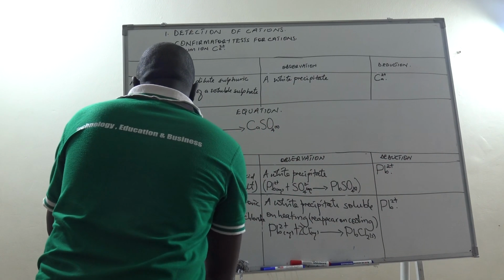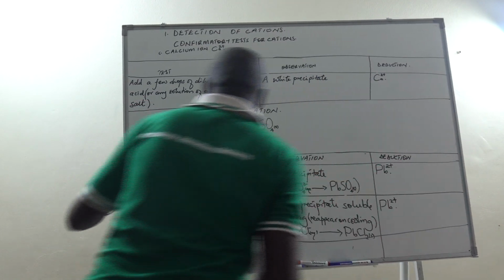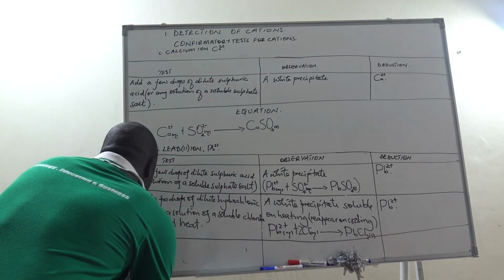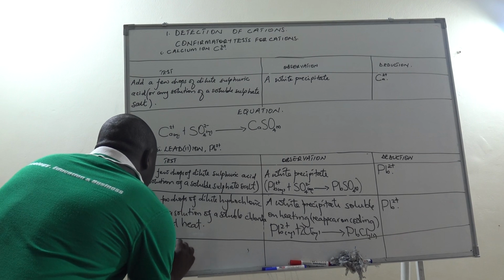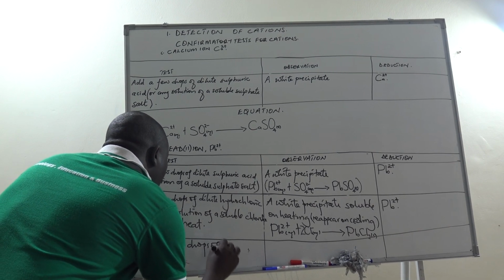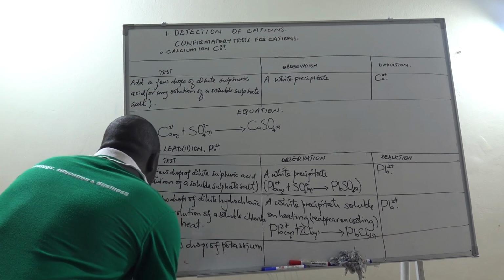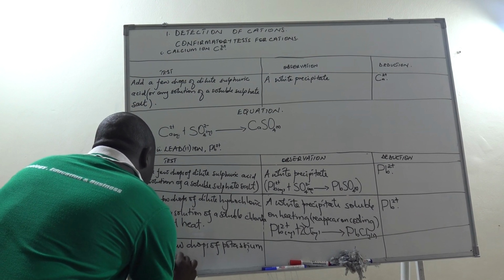And then finally we have the last test here, which is always frequently used, that we need to add a few drops of potassium iodide solution.